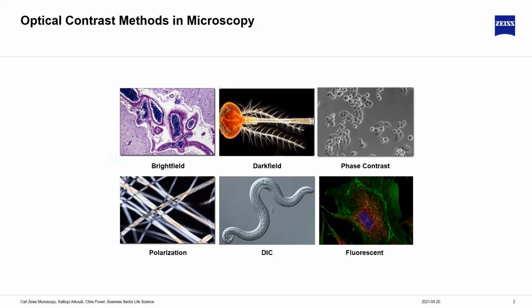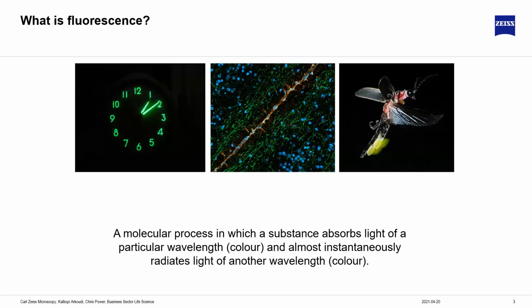And if you think about what fluorescence is, there might be some things that come to mind. If you were to ask maybe children's age, any of these images come to mind. But what I'm showing here are three images where really there's only one of fluorescence. Here we have phosphorescence, fluorescence, and luminescence. And when you're young, you use the words interchangeably, because they all kind of mean chemicals releasing light. But what differs between them is how the energy gets in and how quickly it comes out.